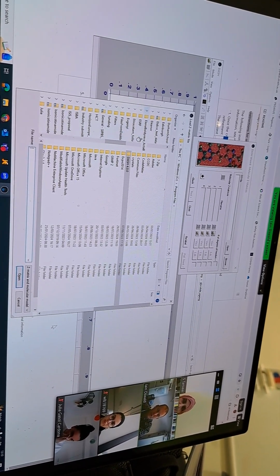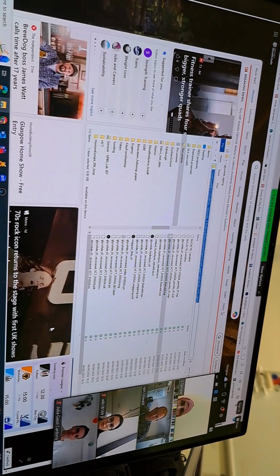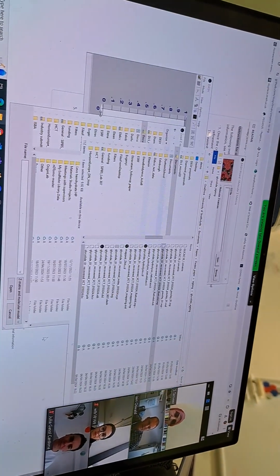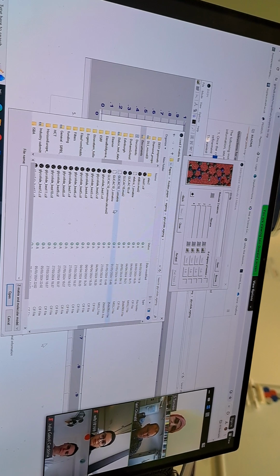So what I'm going to do is repeat what we did here. Where are we? Copy that, paste it into there. Okay, so what did we do last time? Gliad.